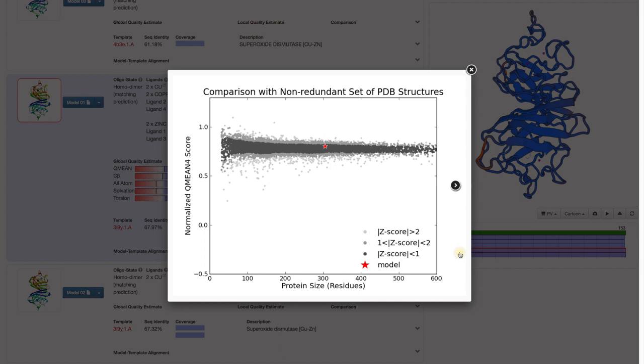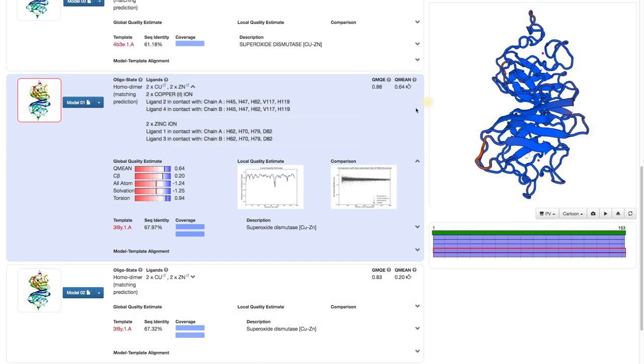In this case, our model behaves very similar to the experimentally determined PDB structures.